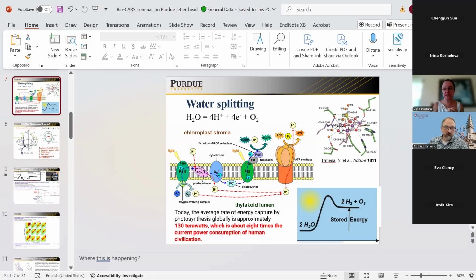And even the substrate. If you talk about substrate water exchange, the substrate is what it acts on, and it has sub-second exchange times. Whenever we do the final preparation step with the D2O buffer, we know those are deuterated, and then that starts to release the deuterium, like D plus instead of H plus. Okay, all right, thank you.